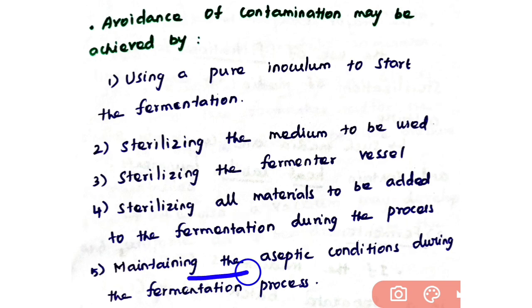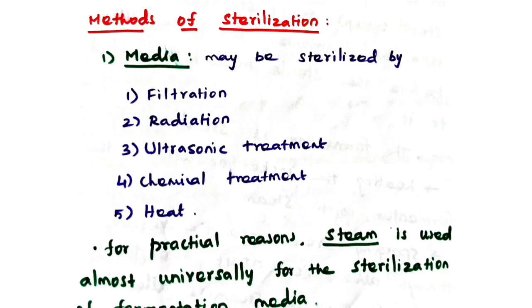Okay, then maintaining the aseptic conditions during the fermentation process. So during the fermentation process also you have to maintain your aseptic conditions. Okay, then let's see methods of sterilization. Okay, so first let's start with media.